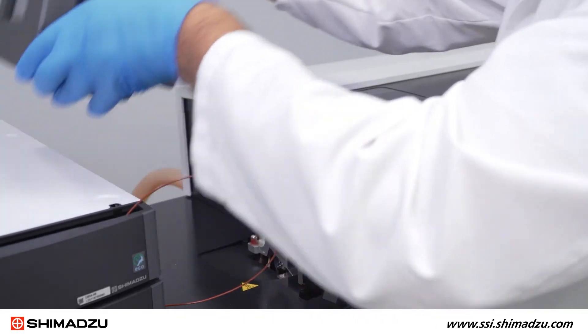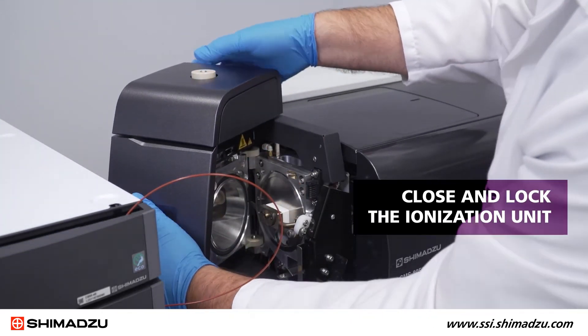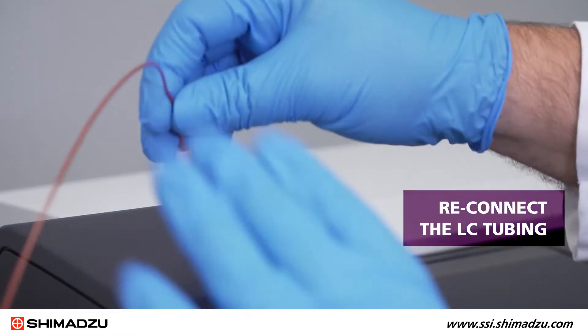Using the same hinge mounts, secure the APCI probe in place. Then you can close and lock the ionization unit in place. Reconnect the LC tubing to be ready to run the instrument again.